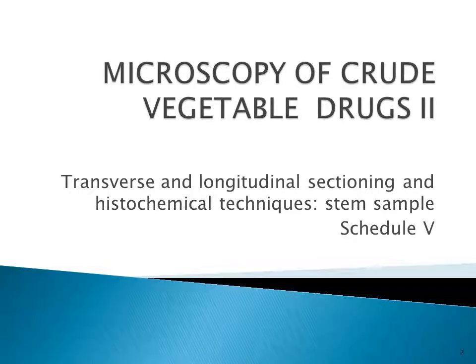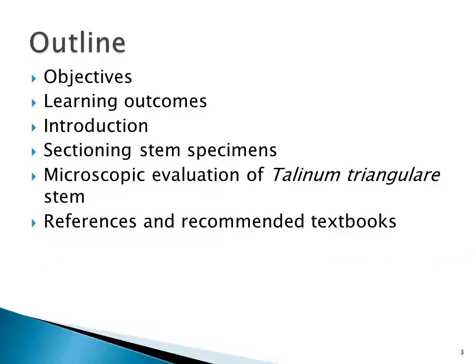For this practical schedule, we're looking at microscopy of crude vegetable drugs 2, with emphasis on transverse and longitudinal sectioning and histochemical techniques with respect to stem samples, and our stem sample of interest is water leaf, that's botanically known as Talinum triangulare.